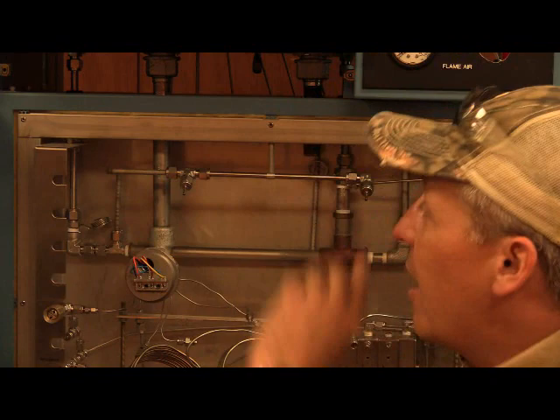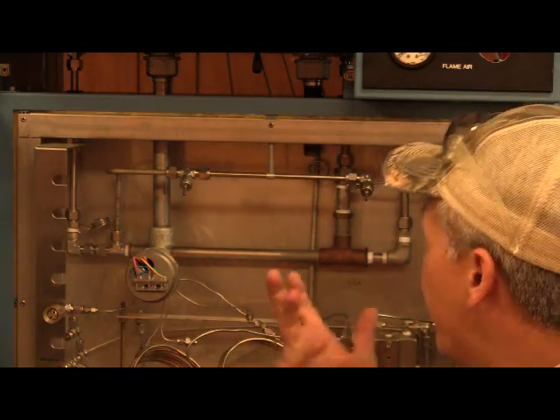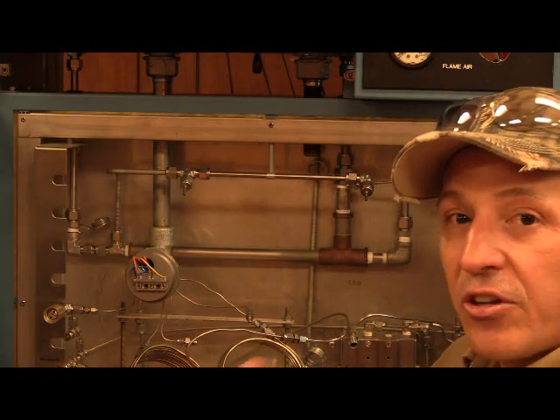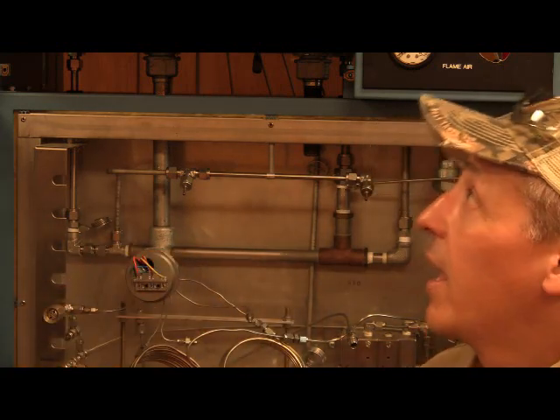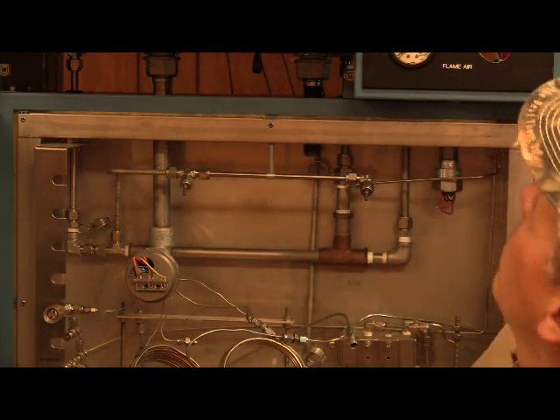The 15 psi that you set there is going to come in and blow into this oven with that hot air, and that hot air is going to warm this up, and we're going to read that temperature, and as we read that temperature, it's going to be controlled and get to 140 degrees, and we will slow down the hitting of the heater whenever we start getting to 140 degrees. Now we're going to overshoot it and then undershoot it, and then we're going to line out, and then it will get to 140 and line out and be super happy. But that's what the very top gauge is for when you say the oven air. We're doing that just for the heater to get the oven to 140 degrees F.